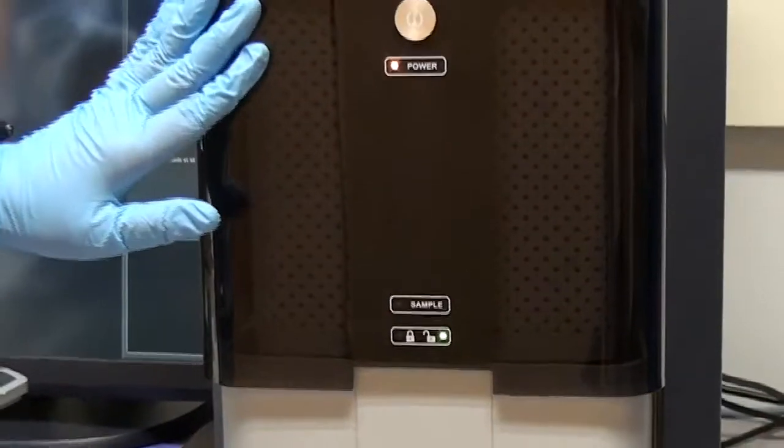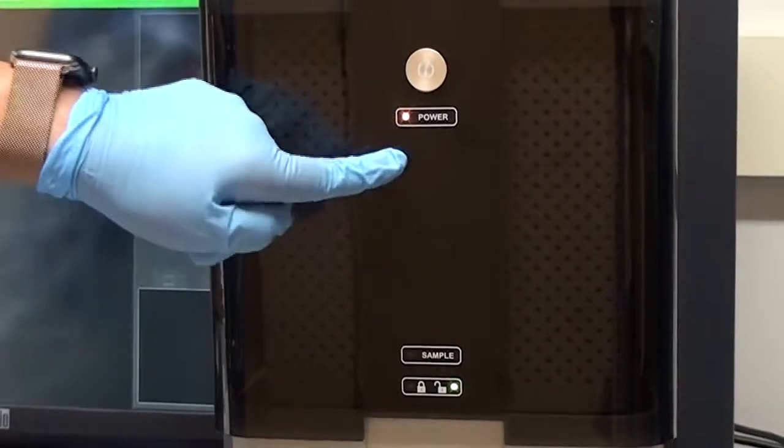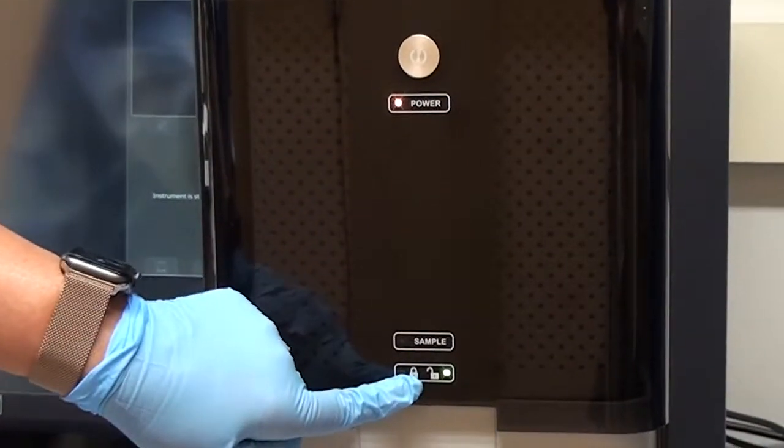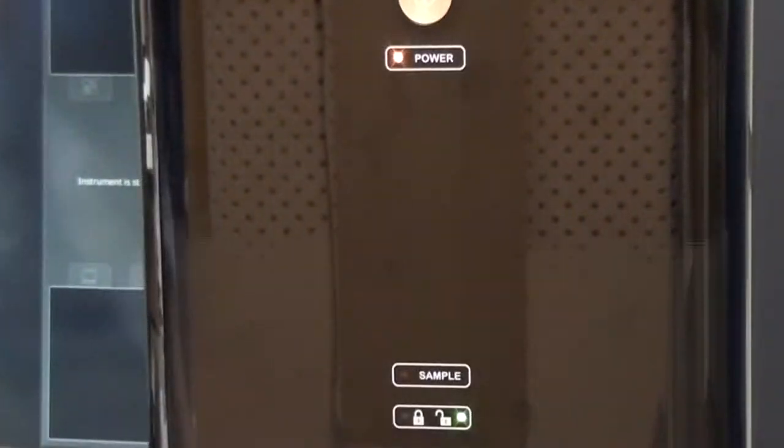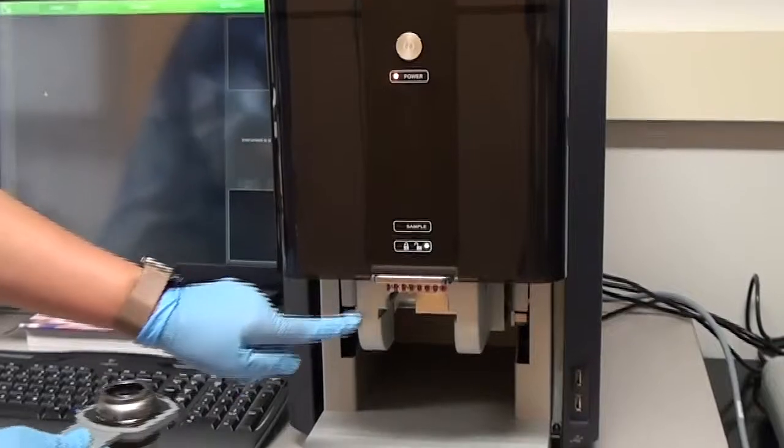The settings on the sample chamber show yellow light and unlocked sign. The chamber door is lifted and we see the grooves here in the slot.